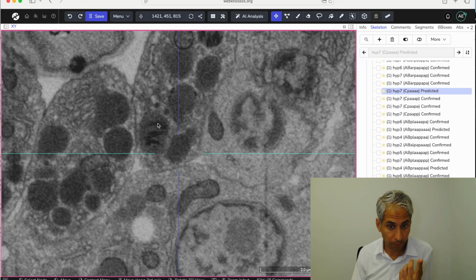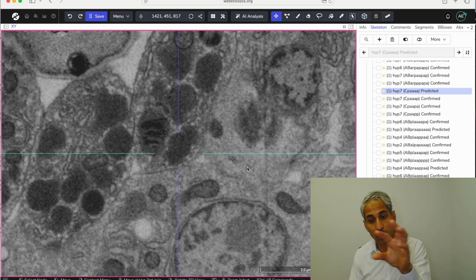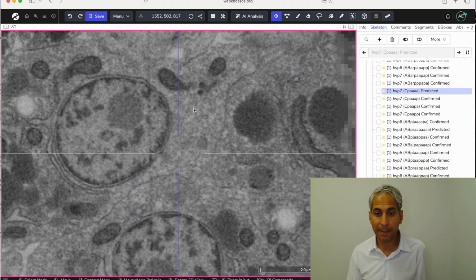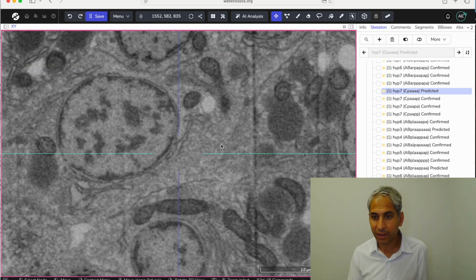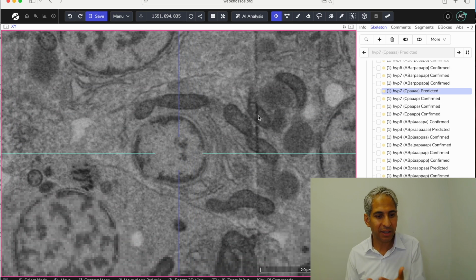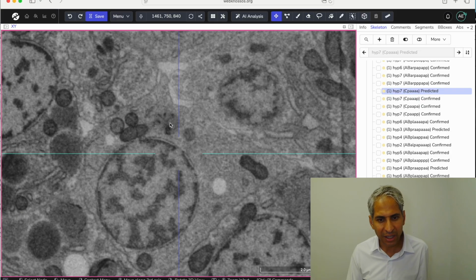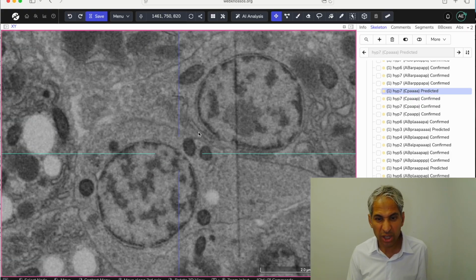What it is, though, is something I hope we're able to discover this semester. Maybe by consulting some references, comparing different cell types, seeing where these are, which cell types have this, which cell types do not, and being able to make some hypotheses and maybe test them somehow. This is the kind of wildness in this data set that leads to questions that can lead to discoveries. I don't think this is mitochondria over here. This though, and this I would say is mitochondria.